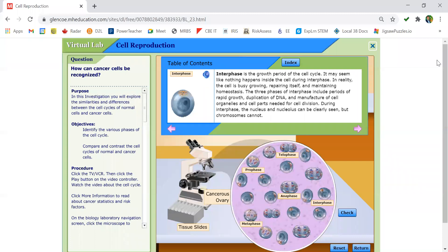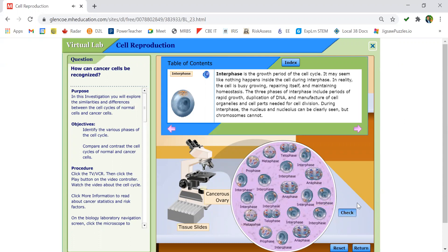Lastly, we have an image of cancerous ovarian tissue. Not very many cells are in interphase — most cells are undergoing cell division in mitosis. Pause the video now to count the number of cells in interphase as well as the number of cells in mitosis. Once you have that, calculate the mitotic index of each tissue.